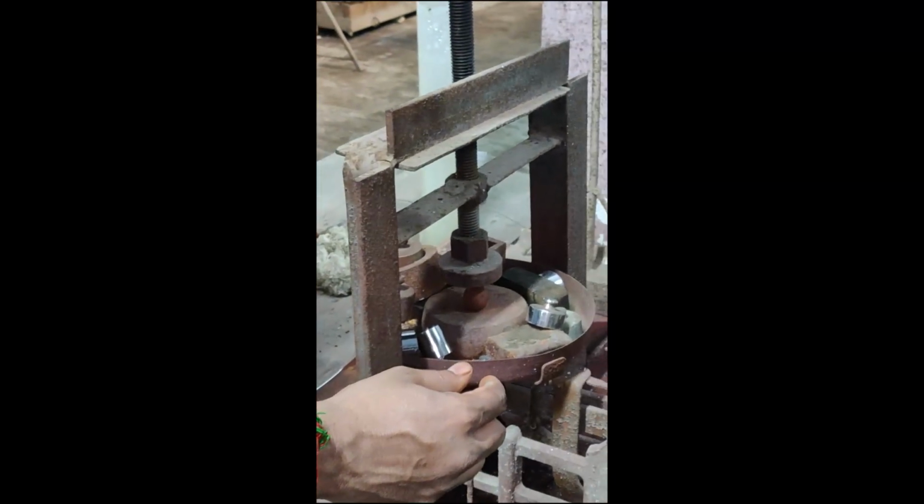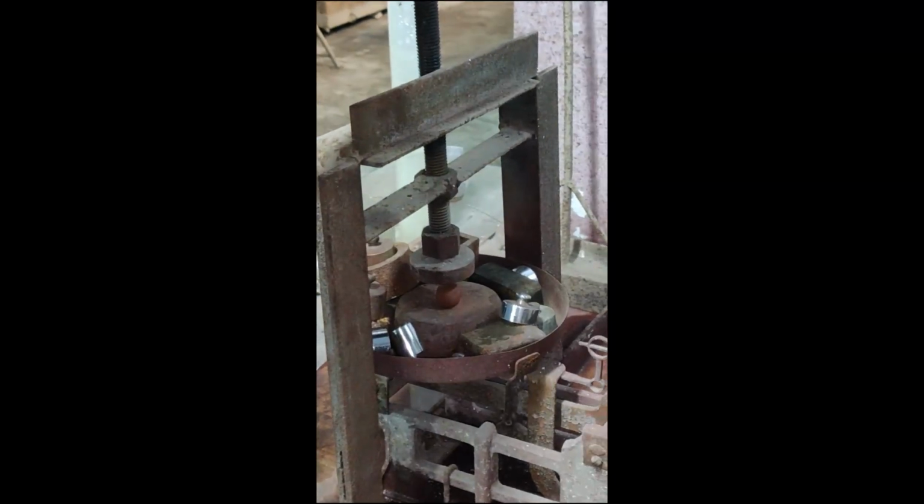Bentonite green pellet. We are checking the crushing strength.